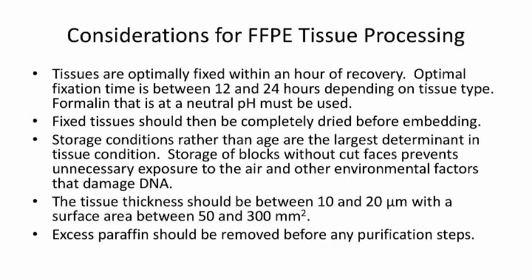A couple quick mentions that we found to be pretty effective working with a diversity of collection sites is keeping section samples cold, and if they can't be delivered cold and within 24 hours of sectioning, that they get put under mineral oil, and that just prevents all those oxidation effects. And then, of course, the mineral oil has to be removed, but the mineral oil will also play a role in the deparaffinization of the sample as well. So it's a little bit of a win-win, but there is the hassle of pulling off the mineral oil.